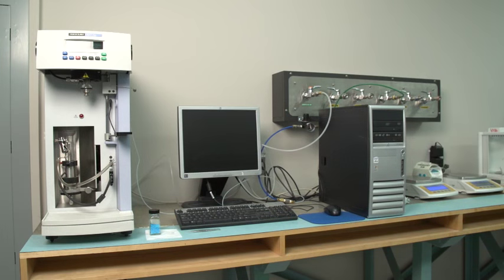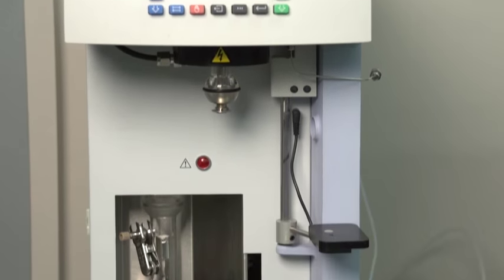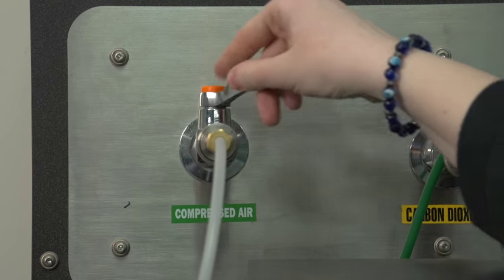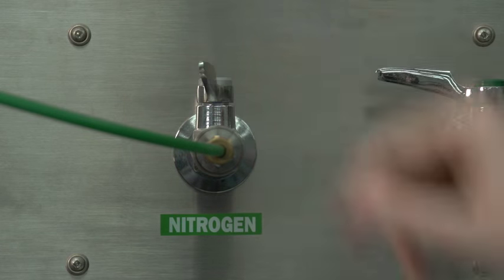The purpose of experiment 17A is to determine the number of water molecules in the chemical formula of a hydrate using thermogravimetric analysis. To set up the instrument, first turn on the air and then nitrogen to maximum flow.